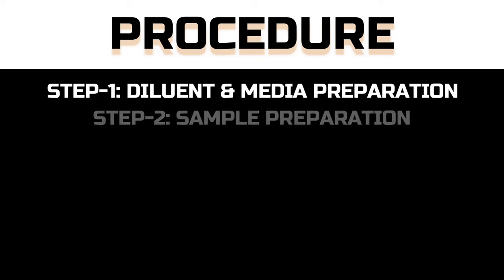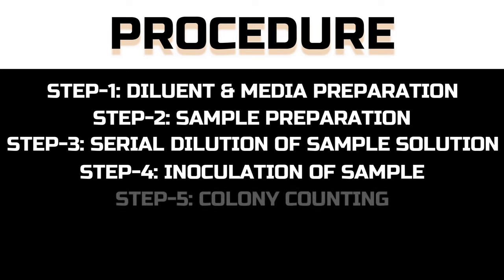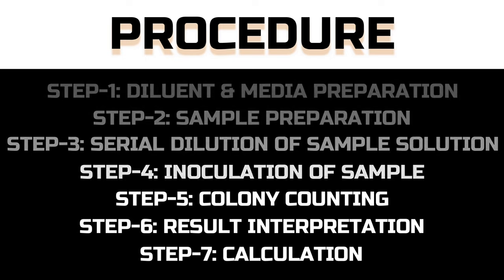This test involves 7 steps: diluent and media preparation, sample preparation, serial dilution of the sample solution, inoculation of sample, colony counting, result interpretation, and calculation.